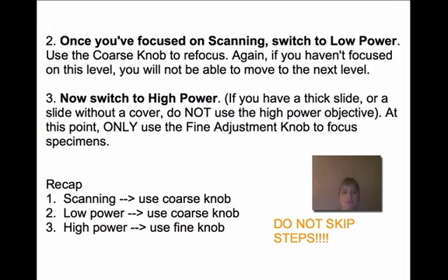Okay, so just to recap, you're going to start with the scanning, so the lowest power, and use the coarse knob. Then you switch to low power and use the coarse knob. And then you can switch to high power and use the fine focus.